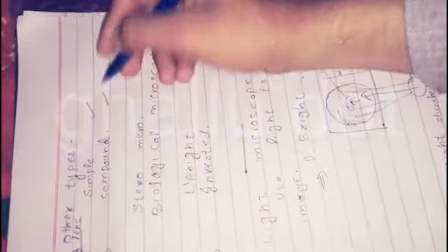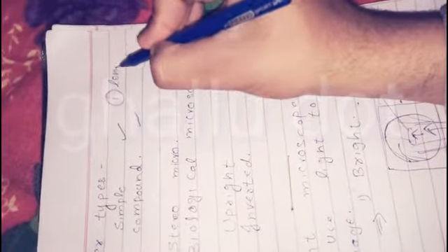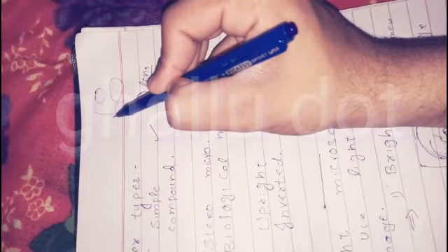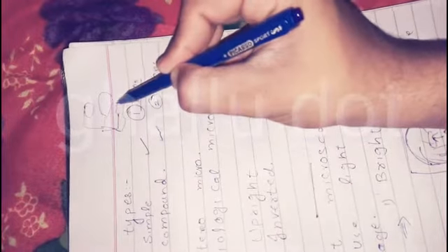Next one, we will talk about other types of microscope. I have told you that I will not discuss the electron microscope or atomic. We are just describing the light microscope and other types of microscopes. In a simple microscope there will be one lens. These were used early. Early scientists in the 19th century used the simple microscope having just one lens.